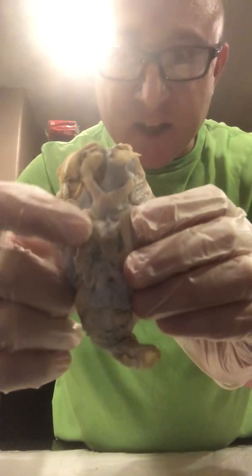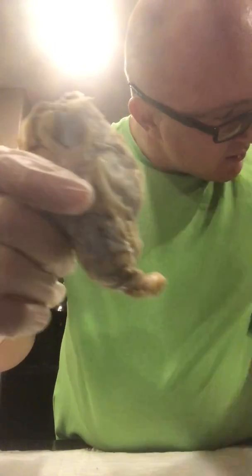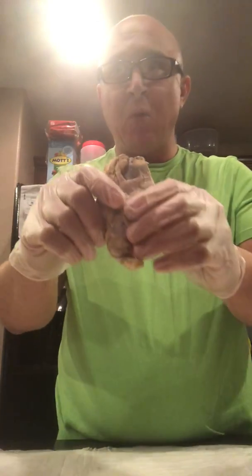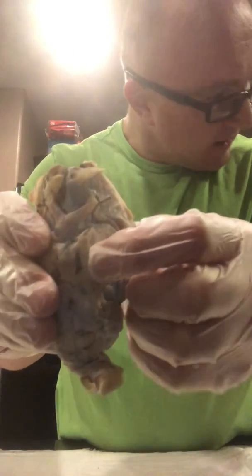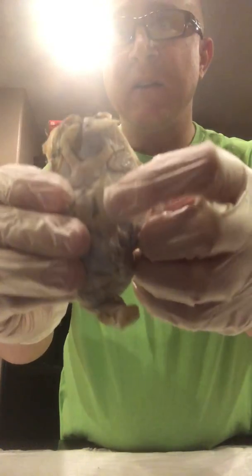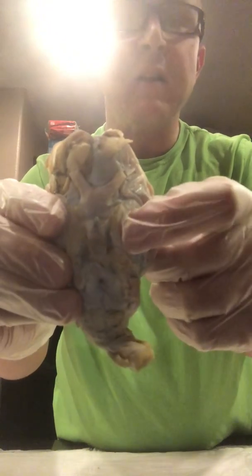The optic chiasm is in the center here. The oculomotor is going to be roughly below slightly of the optic tract here. So it's going to be probably a little bit underneath there.